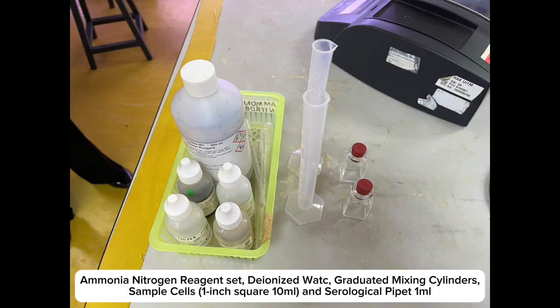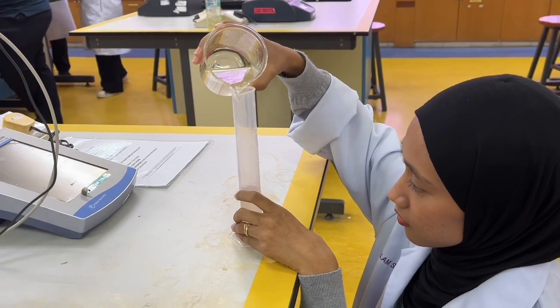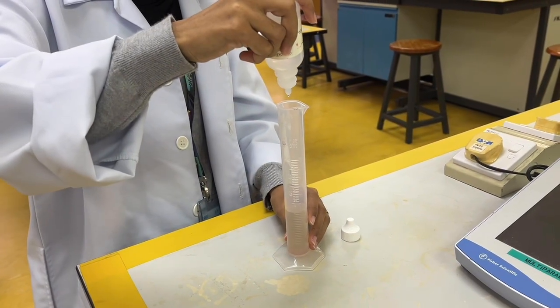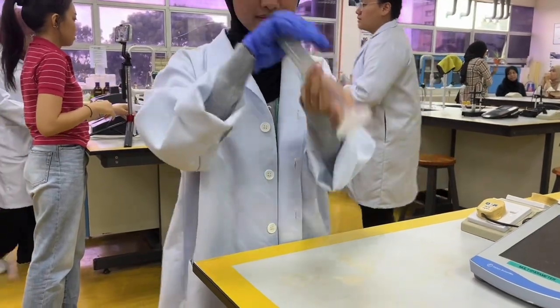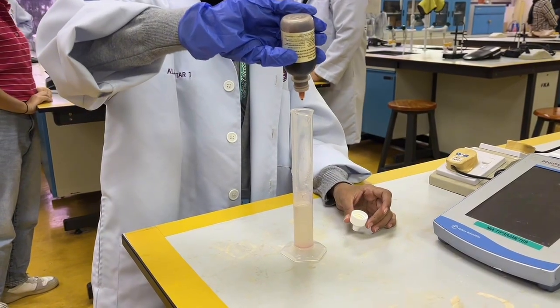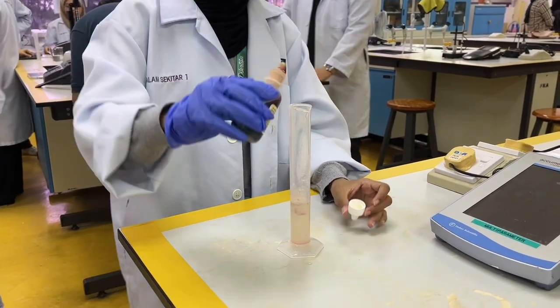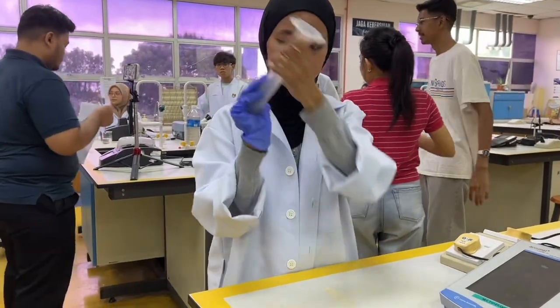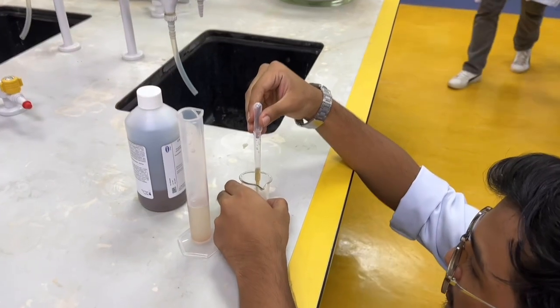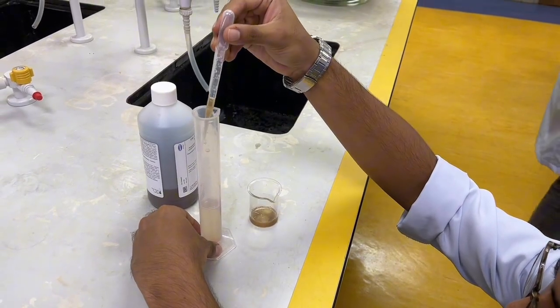For the procedure of this test, firstly we must prepare a sample, which is to fill a 25 milliliter mixing graduated cylinder to the 25 milliliter mark with the sample. The next step is to add 3 drops of mineral stabilizer to each cylinder, stopper and invert the cylinder several times to mix. Next we must add 3 drops of polyvinyl alcohol dispersing agent to each cylinder, stopper and invert several times to mix. And then add 1 milliliter of Nessler reagent into each cylinder, stopper and invert several times to mix.